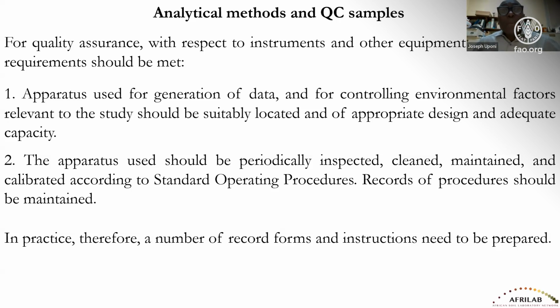Every equipment we use in the lab have specified procedures for checking that they are working properly. And it's very important to do this periodically to be sure that your equipment are functioning well before you begin to do analysis. That means a lot of records and forms have to be in place. Actually, part of good laboratory practice is that you keep a record of all these documentations of calibration of your equipment and tools that you are using in the lab.